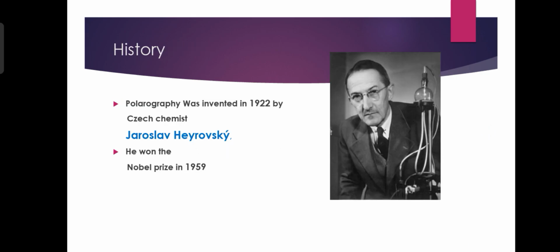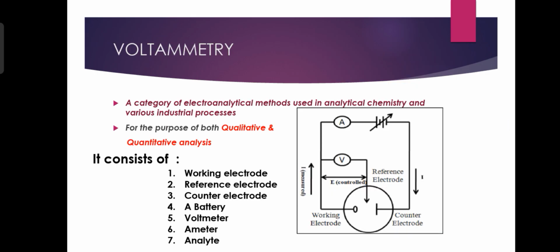Next, the history of polarography. It was invented in 1922 by the Czech chemist Jaroslav Heyrovský, who won the Nobel Prize in 1959. Next, first we have to learn what the voltammetry process is.